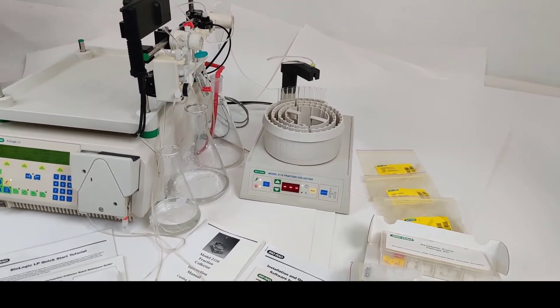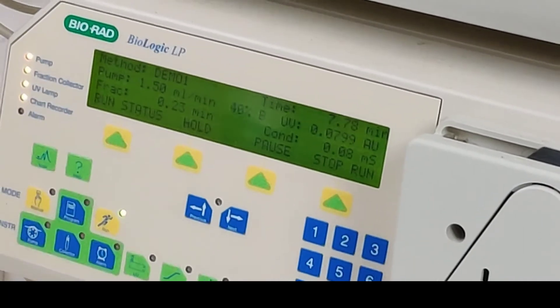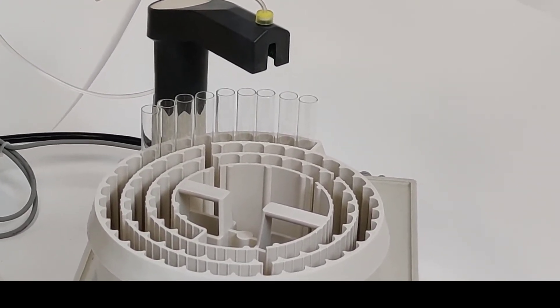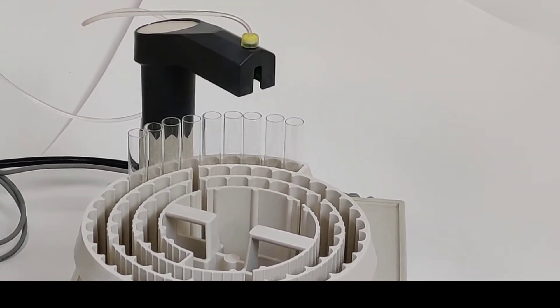It comes with the instruction manual. The fraction collector is about to move again — in about 10 seconds it's dispensing the samples.